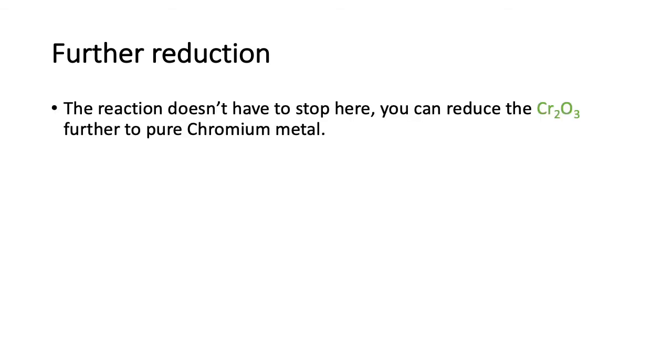But you don't have to stop there. You can reduce it even further down into pure chromium metal.